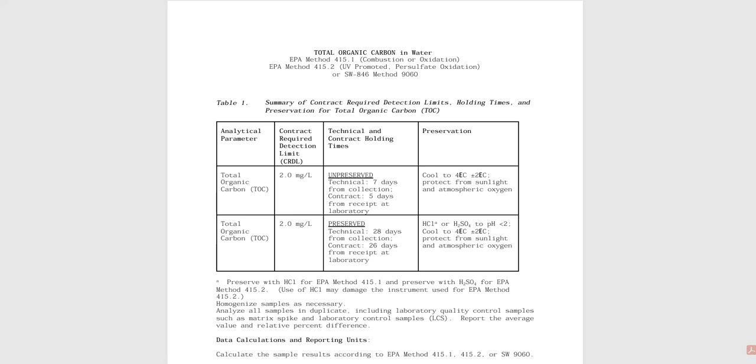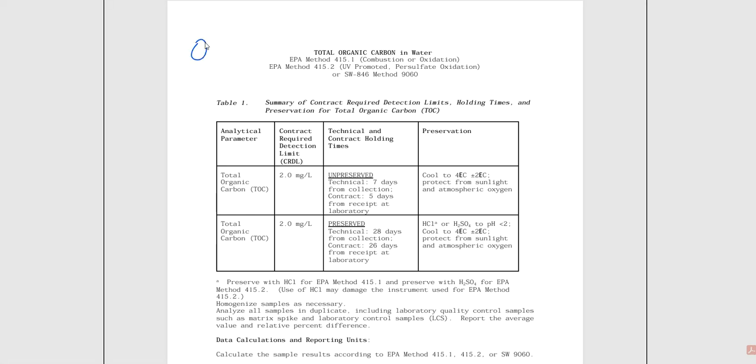And this is going to be a summary of all of, guess what, the QC things that need to go on with the lab. So you are Miss Sally SOP, and you are walking into your desk and sitting down and you're like, okay, how can I make the lab staff miserable? No. But that's kind of what it feels like sometimes with the lab staff when they see Miss Sally SOP walking down the hallway. And it could be Mr. Sally too, I don't know. Because, hey, one is as bad as the other.